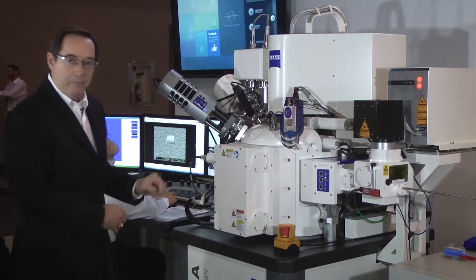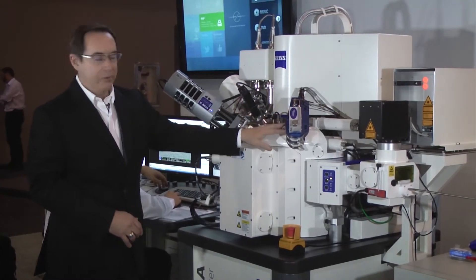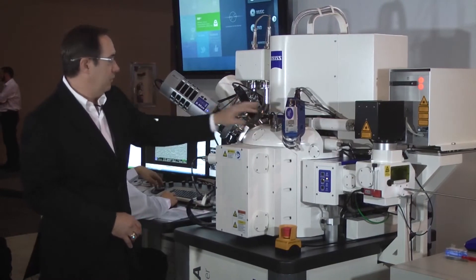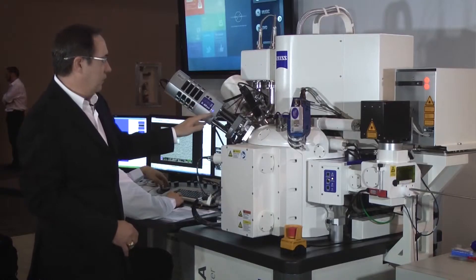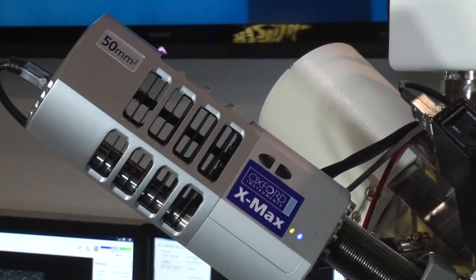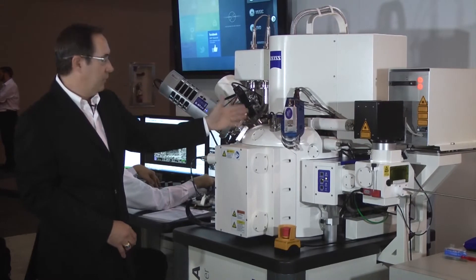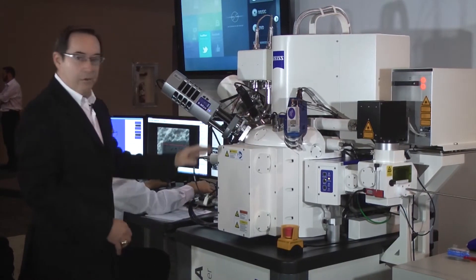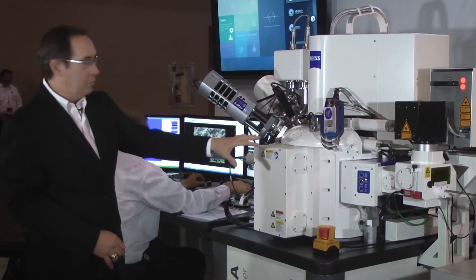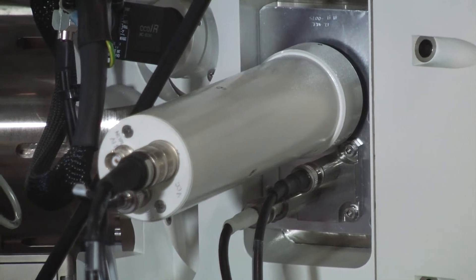A couple of the other components on the chamber side: we have a plasma beam here for cleaning samples, and we have an EDS detector so we can do X-ray analysis of the samples after we've done our cross-sectioning in the FIB. All of these components are nicely controlled in one location on one control panel.